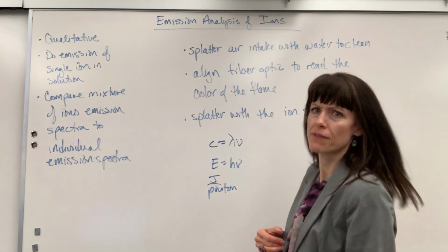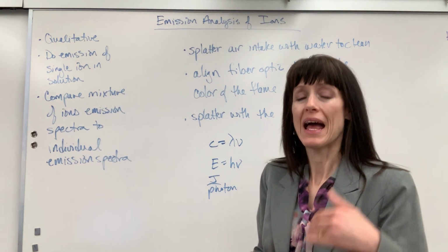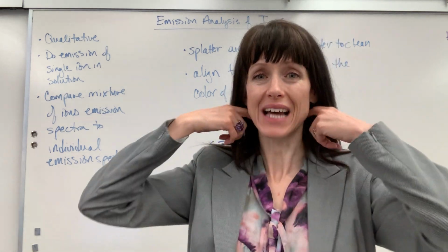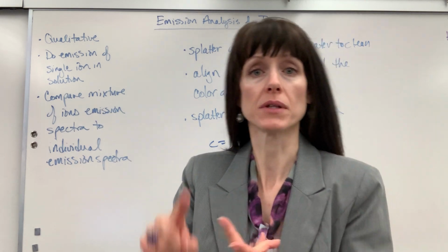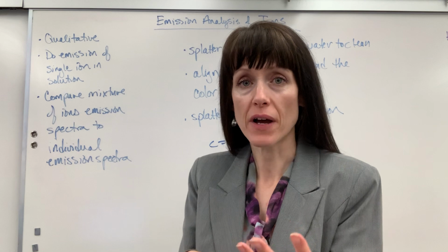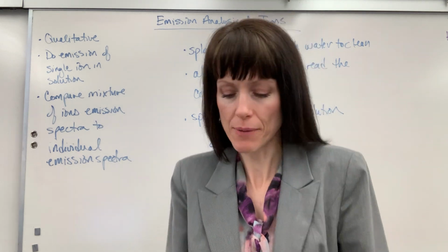So there you have it. It's a fun lab, all qualitative. You can't quantify it. You can't determine how many ions, what's the concentration of sodium. You're just identifying what's in the solution. Oh, I see there's a sodium and a strontium inside the solution. So it's all qualitative, just identifying what's there. You can't quantify it and give the amount of ions.